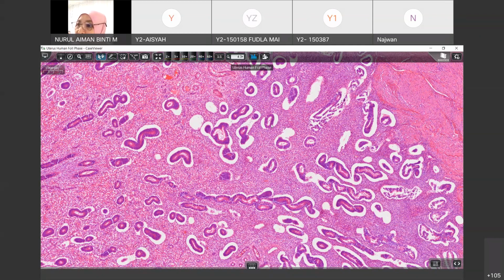Okay, so try to look at this. The basal layer, the cells are more compact, so the nuclei will still be more basophilic, bluish. When there is a large cell population, you'll find a lot of nuclei inside, and it will appear a little darkish or basophilic.